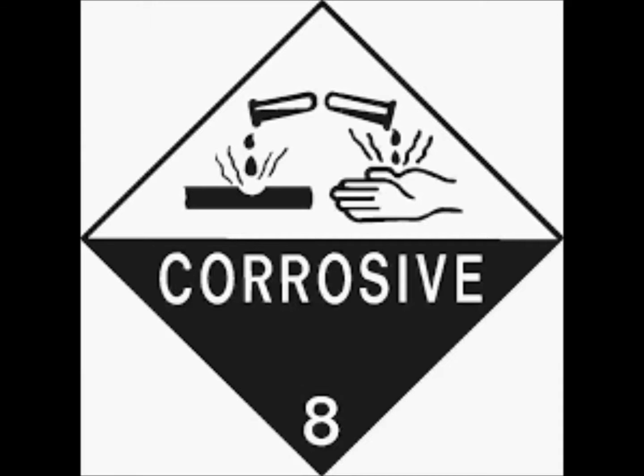This synthesis involves the use of corrosive acids and produces acid vapors. As such, the proper safety materials are required, those being safety goggles and either performing the reaction outside or in a fume hood.